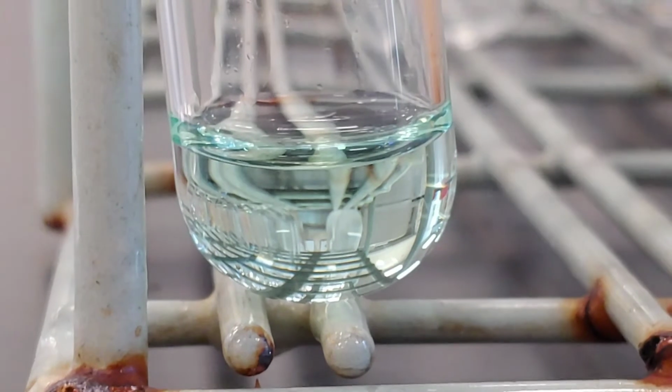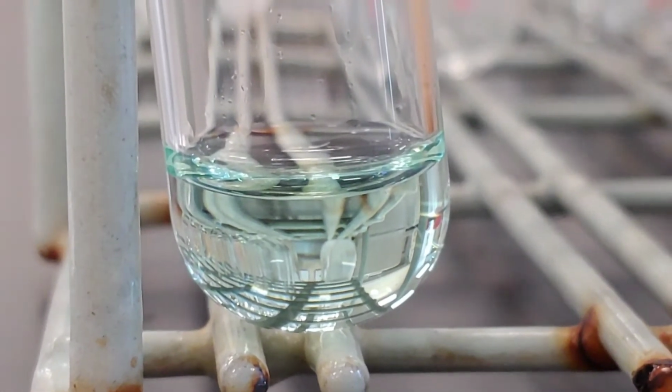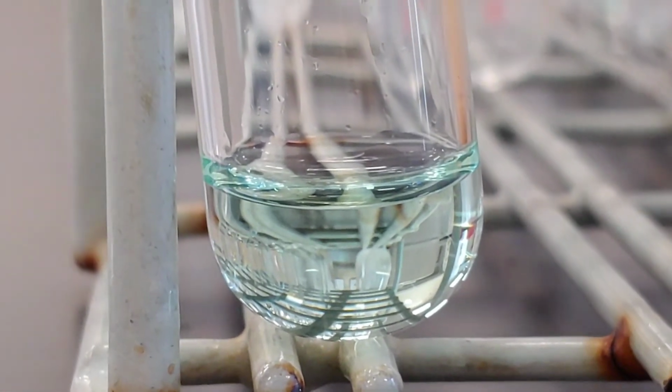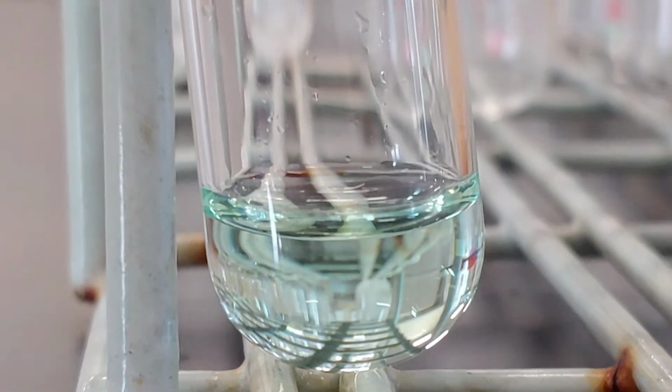Okay, we're on reaction number 6. This is aqueous nickel nitrate, kind of a greenish blue aqua color, and we are going to add aqueous sodium hydroxide.